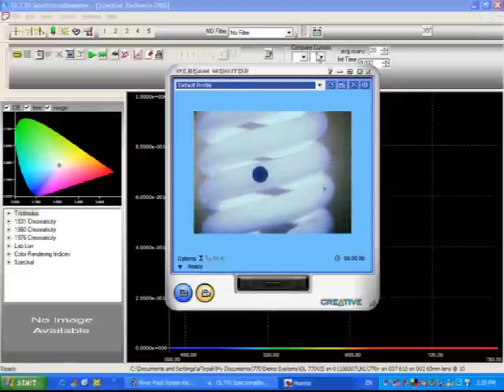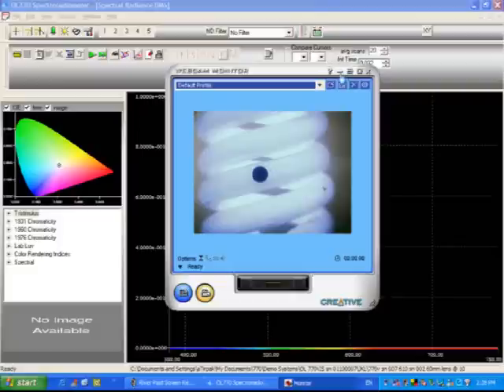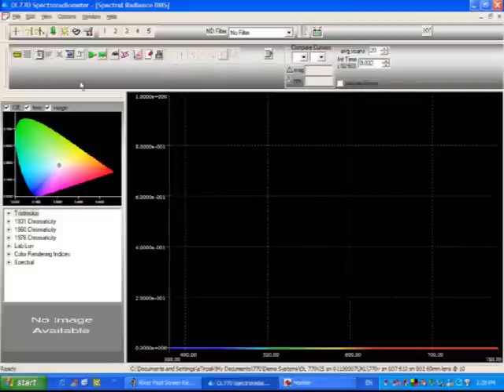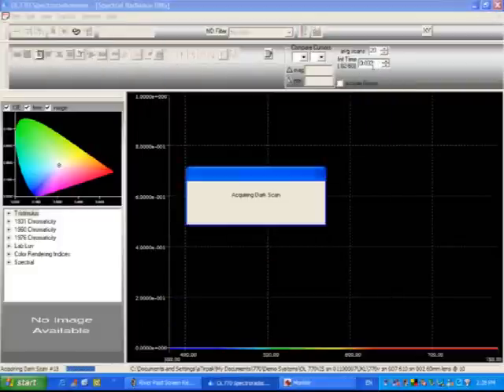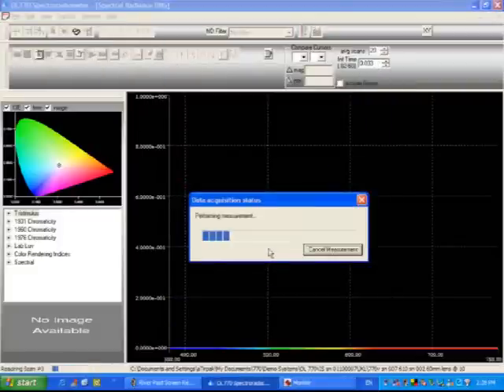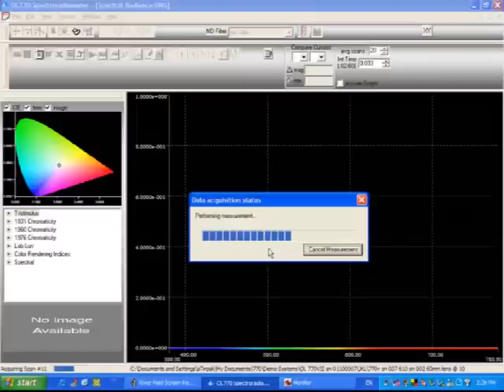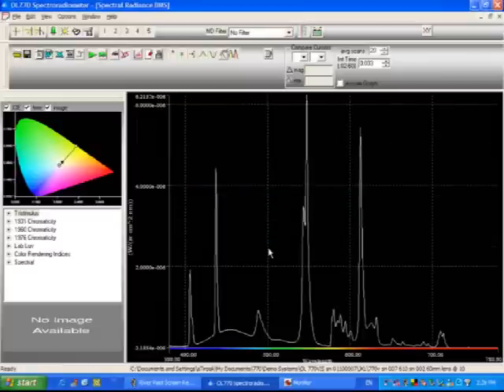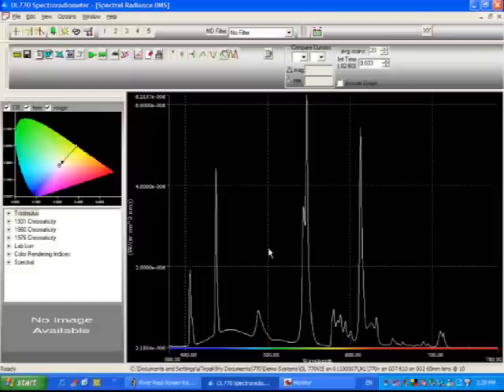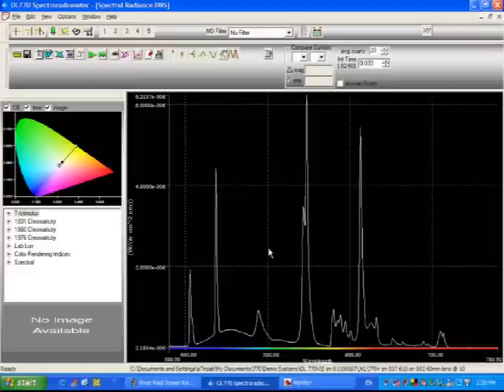I'll move this out of the way and I'll take a measurement very quickly here. You can see we're at a 33 millisecond integration time, so we're able to take 20 scans very quickly. And there's a sample scan. Now, this is not a calibrated scan. It is calibrated for wavelength, but not for intensity. That's essentially all there is to taking measurements with our OL-770 spectradiometer.